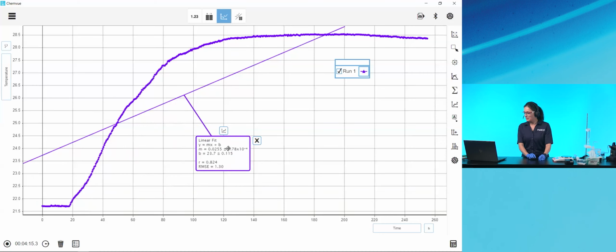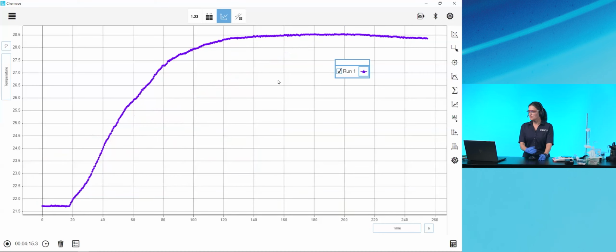So anyways, I would do a couple more runs, and I would want to know, what is the average maximum temperature? What is the average estimated error temperature based on the linear fit and looking back at when the solid was dumped into this solution? Now I have some other analysis tools I want to show you before I get to the more detailed analysis tools.